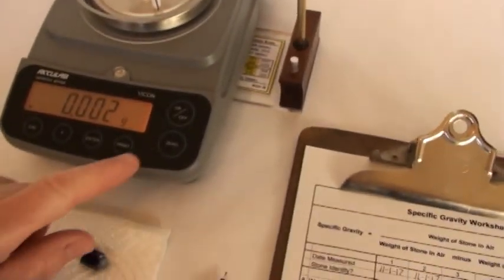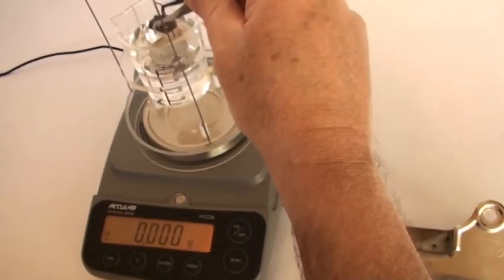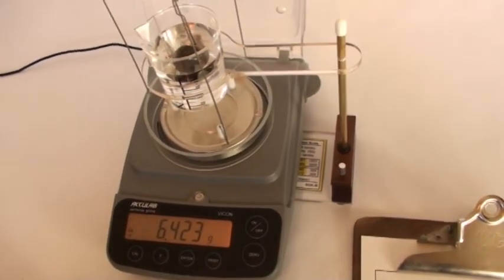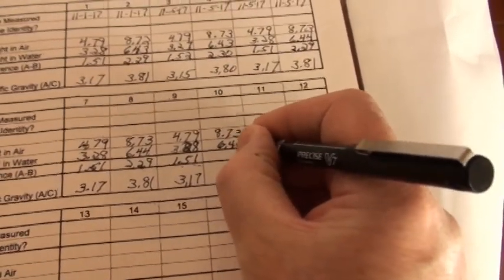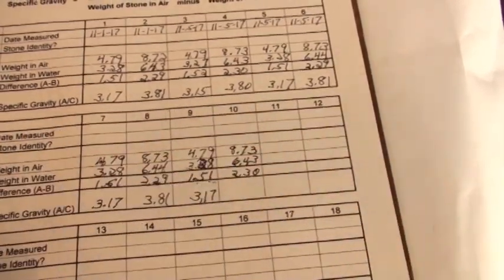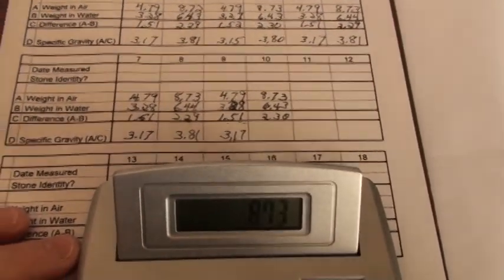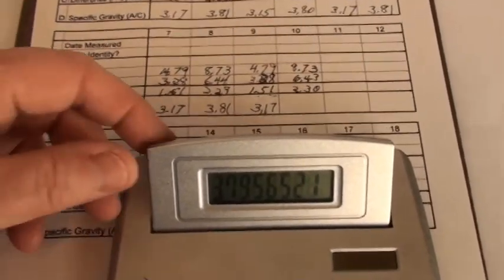Now for the weight in water. We extract it. Tare the scale again in case there's any drift. Weight in water. Looks good. And that value is 6.43 grams. Weight in water. Our difference being 2.30 grams. Now for our final division step: 8.73 divided by that difference of 2.3 gives us an SG of 3.80.